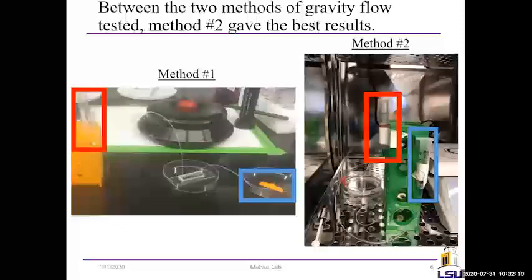Okay. Was there any particular reason why you chose that height difference? Not precisely. Pressure and gravity work differently at different heights, which was probably why we did that. It also was helping with our variables to see exactly what was being differenced. Okay, thank you.